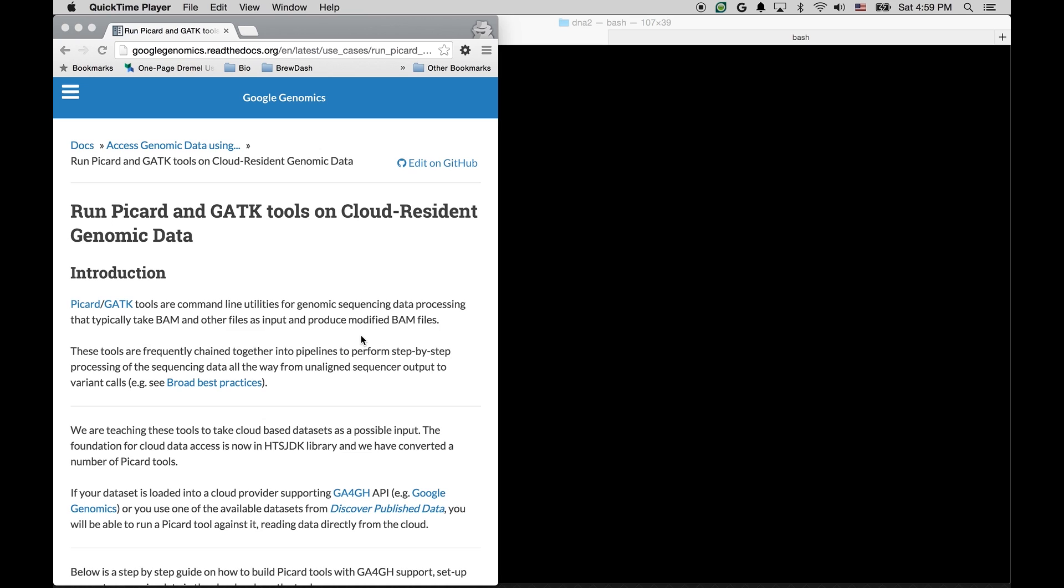Today, I'm going to show you how to build and run Picard tool against the dataset stored with Google Genomics. All the instructions can be found on our googlegenomics.readthedocs.org website.